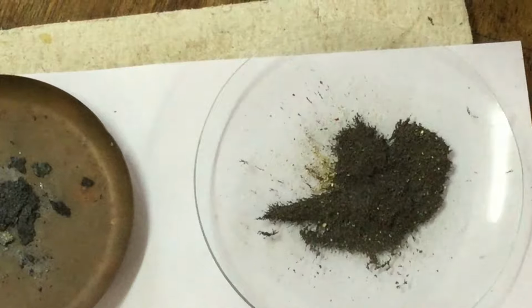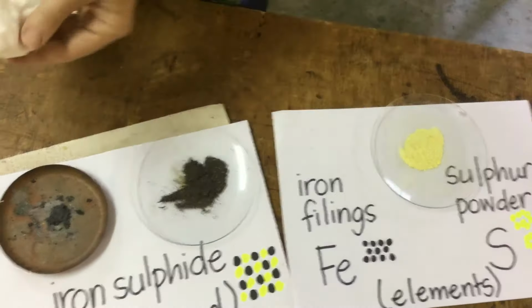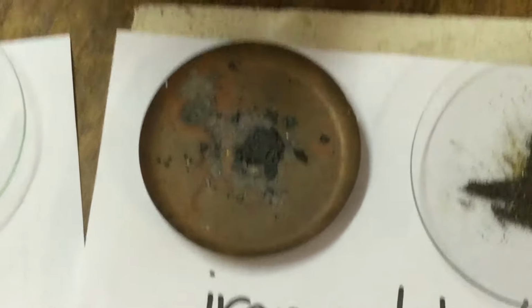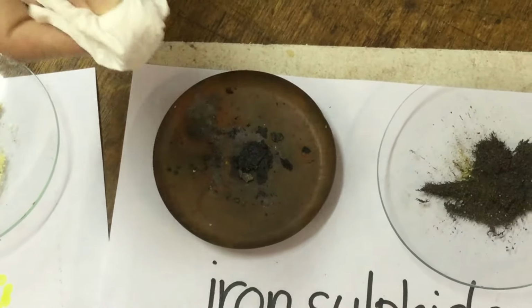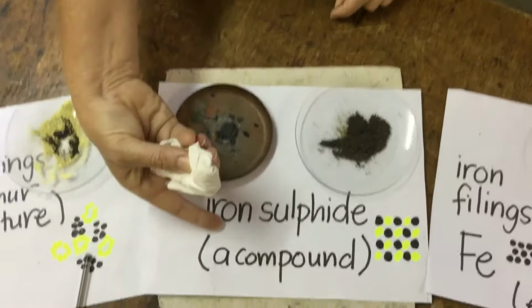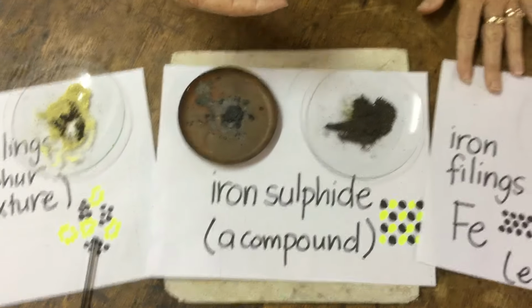And we said that the sulfur was non-magnetic. So the new substance that's been formed, the new compound iron sulfide, let's see if it is magnetic. We've got a new substance that is not magnetic because the iron is now part of a compound and has new properties because it is a compound.